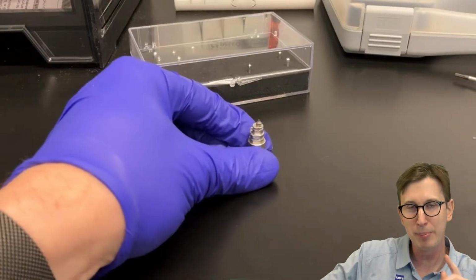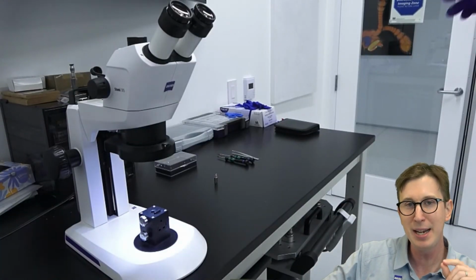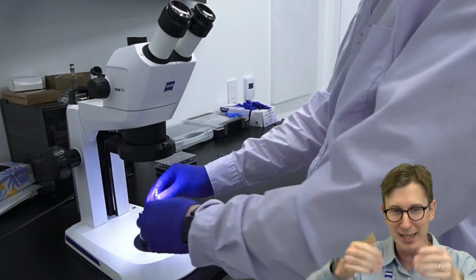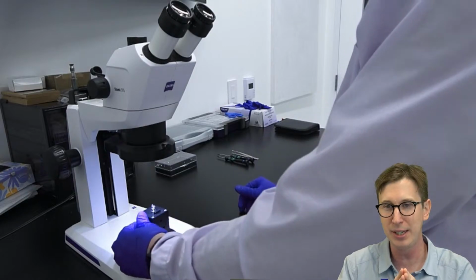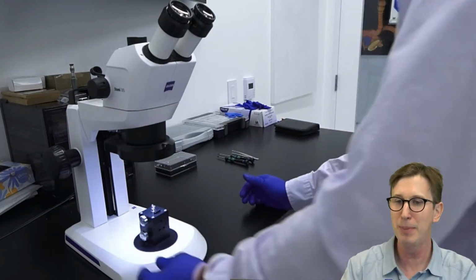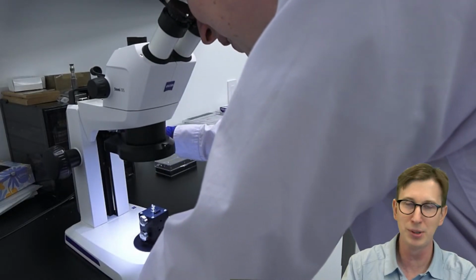Now, before I could bring this to the Volutome, I have one more task to do. I need to center this pin to make sure that it is facing the right way and it will be set up well for when I bring it into the Volutome. So part of the Volutome solution is this stereo microscope, which has a special stage that I've put the sample holder into.